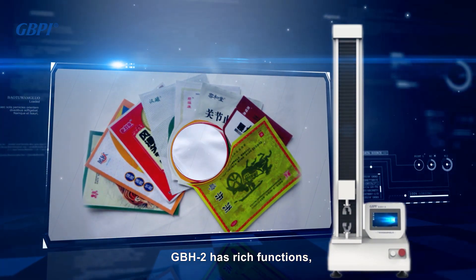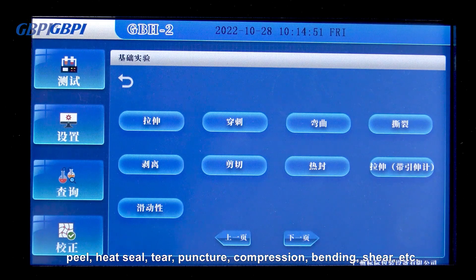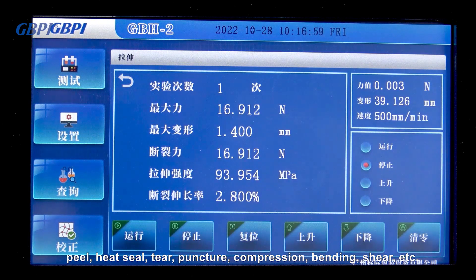GBH2 has rich functions. It can perform basic experiments such as tensile, peel, heat seal, tear, puncture, compression, bending, shear, and more.